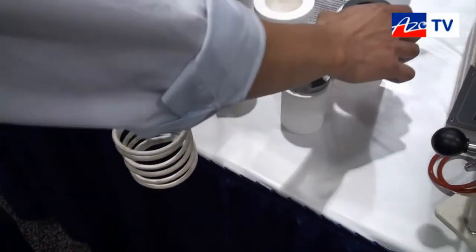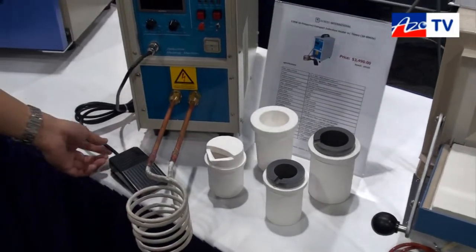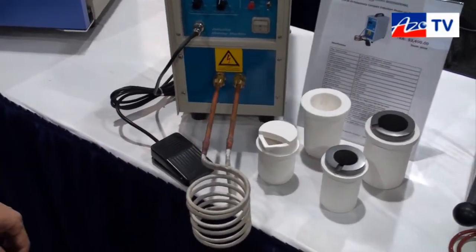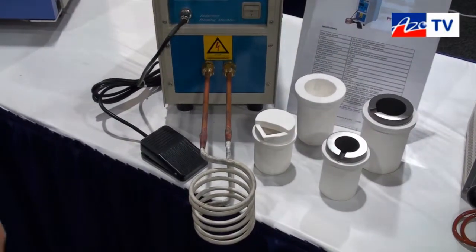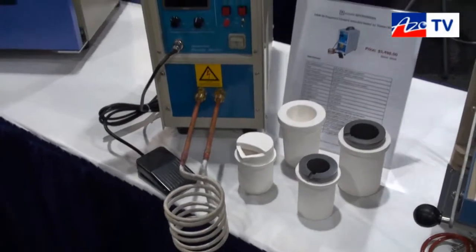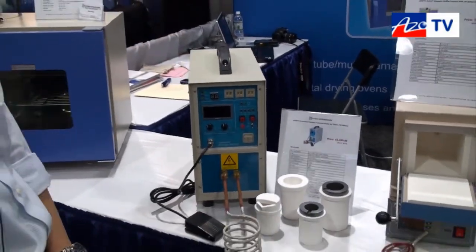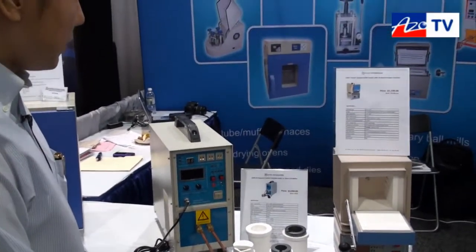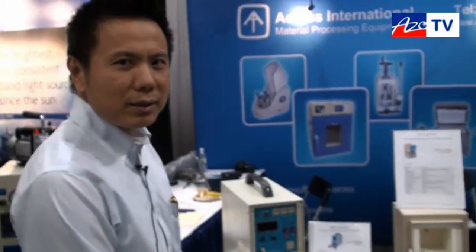This machine is water-cooled with connections in the back, and you can also have a remote foot switch to turn it on or off so that you can be away from the heat. It's very compact — you can lift it with one hand. This is our new induction heater, model number IH15A.